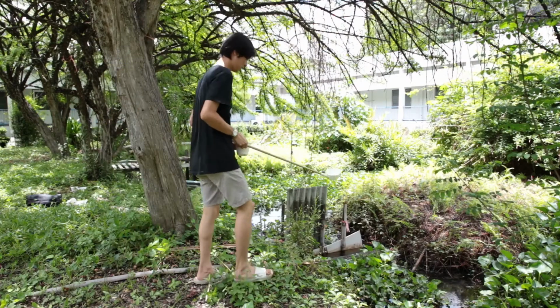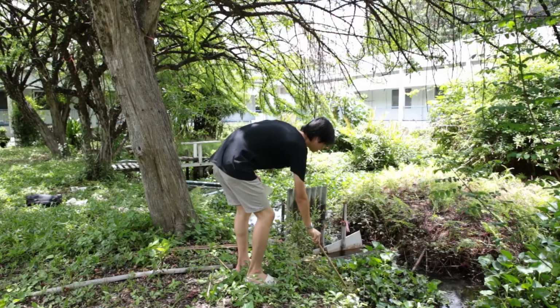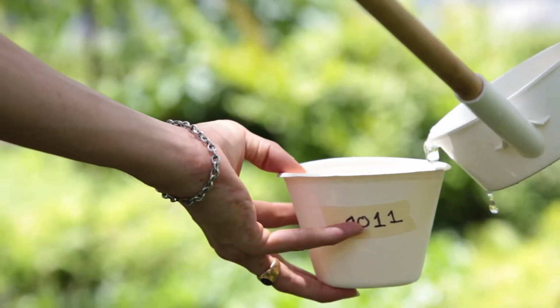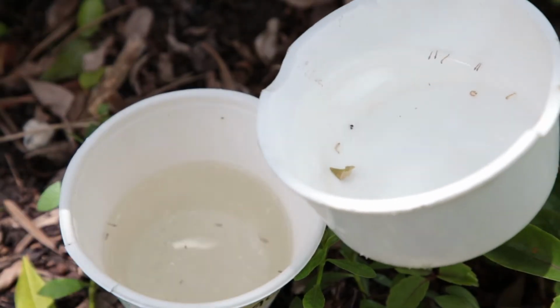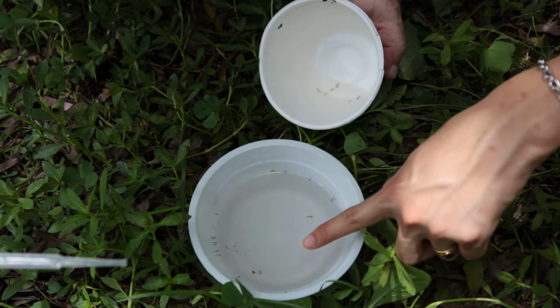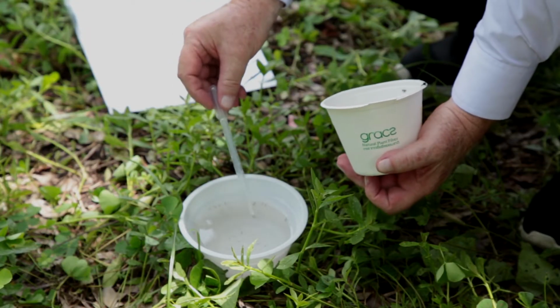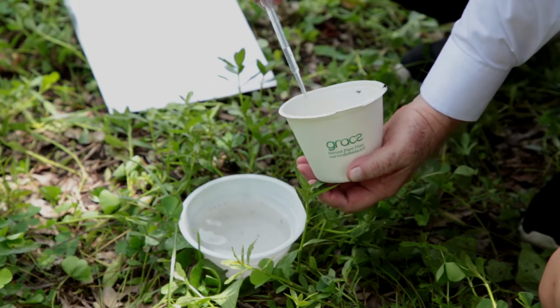Most field collections from specific habitats or breeding pools yield low numbers of larvae. And to save space, it is easiest to keep the larvae in small containers with water taken from that particular habitat site. Transfer the larvae you have collected into the cup. Make sure to remove all non-anopheline larvae using a pipette. Many species of mosquitoes have predatory larvae and they will kill the Anopheles larvae, so take them out.